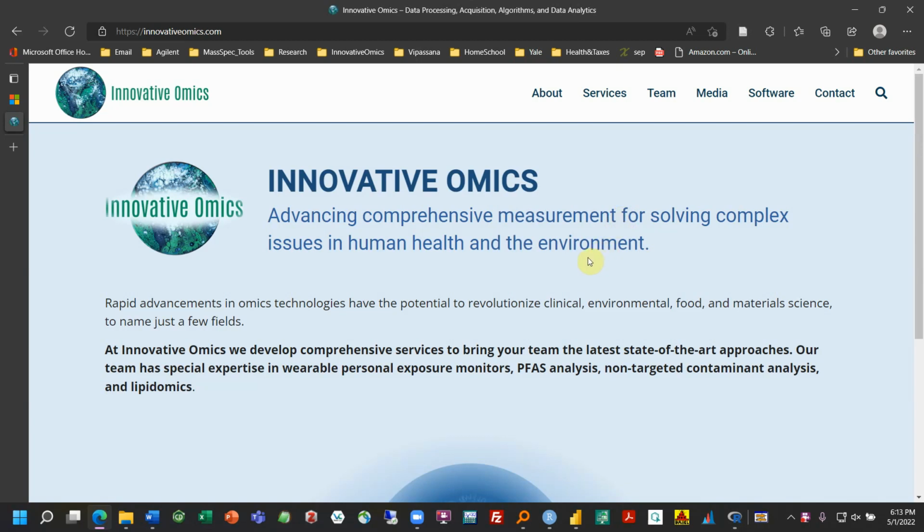Hello, this is Jeremy Colmel, and today I'm going to be talking about FluoroMatch Visualizer. This is a platform where you can visualize your PFAS non-targeted data and be able to start confirming identifications, as well as discovering unknown compounds.